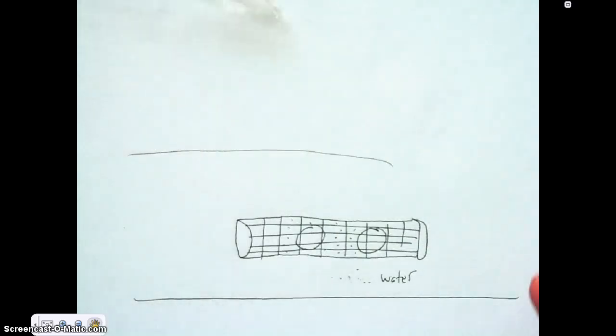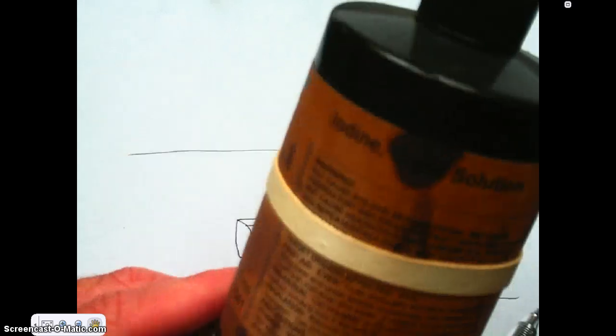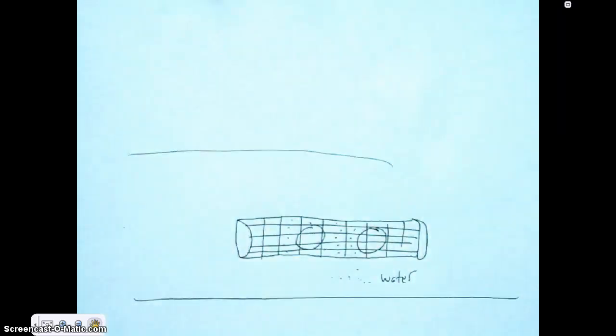The second thing I'm going to give you is some iodine. Now, you remember that iodine, we've used this in other labs before. We use it to stain things, to view under the microscope, and we also used it as a reagent to react with starch. And remember, it turns purple, or darkest purple-black, when it's in contact with starch. So I'm going to give you as much of this iodine as you want.